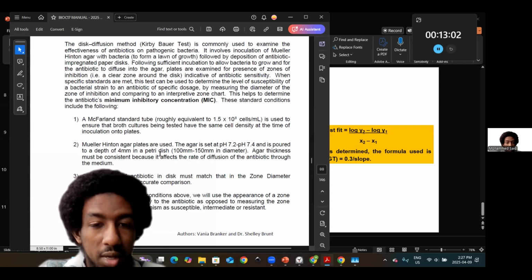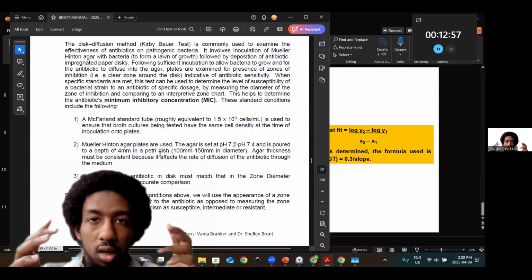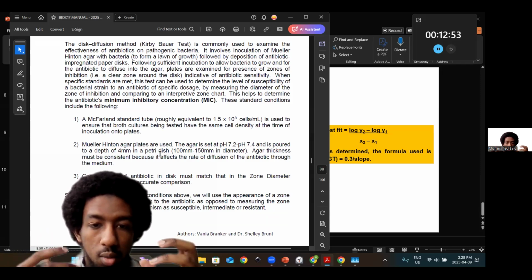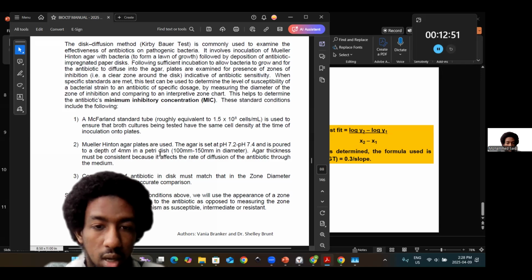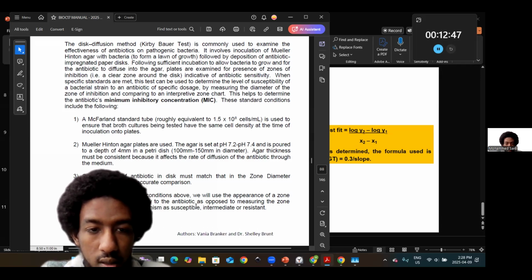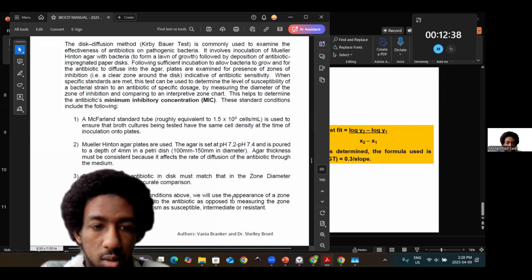to note because they also impact the level of inhibition, i.e. how large your zone is and the morphology of your zone, which is something that you want to keep in mind, right? Because they actually influence the different conditions you see here, i.e. if the organism indeed is susceptible, intermediate, or in full resistance, or essentially resistant to your antibiotic.